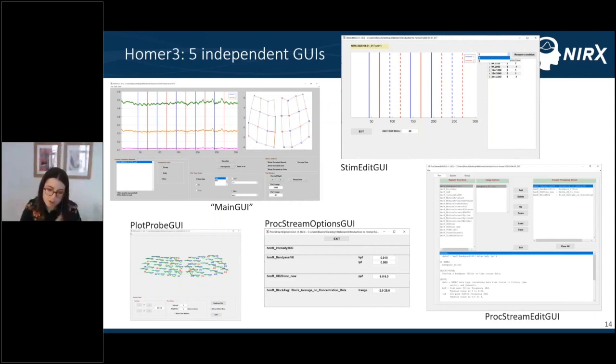These last 2 GUIs, we are not going to look at deeply, like seeing all the functions and the parameters that we could enter, because, as already said, that will be covered in the webinar by Dr. Bushel next week. And typically these 4 GUIs will be started from the main GUI. This is the example we are going to take today, but any of them can be run separately from the MATLAB command window if you need to just look or edit something specific.